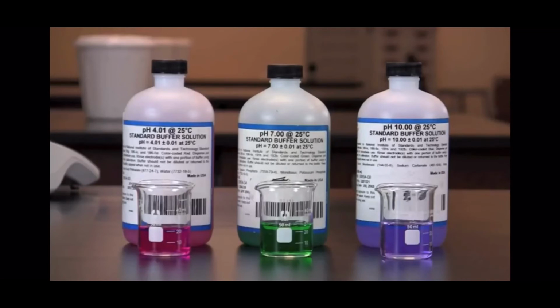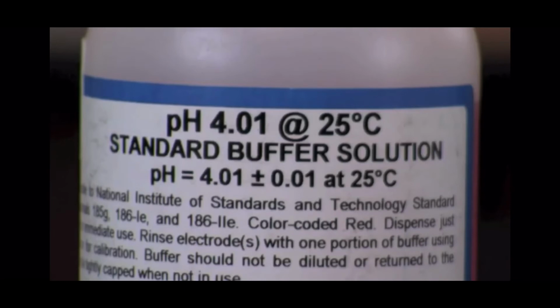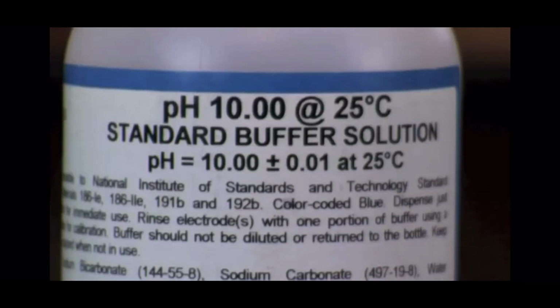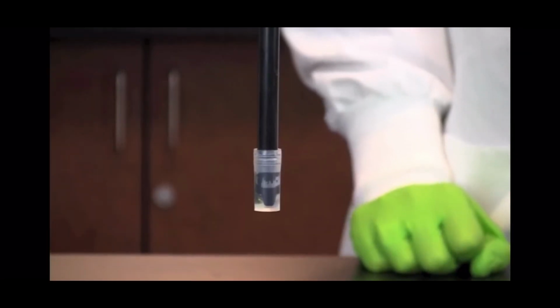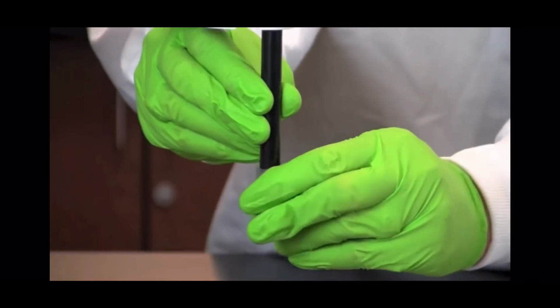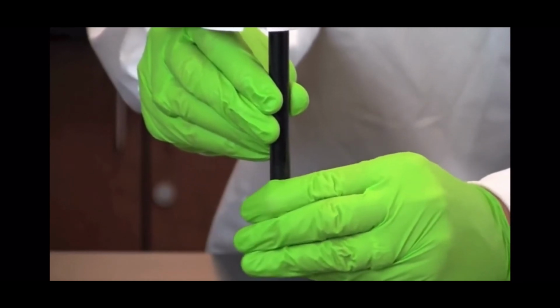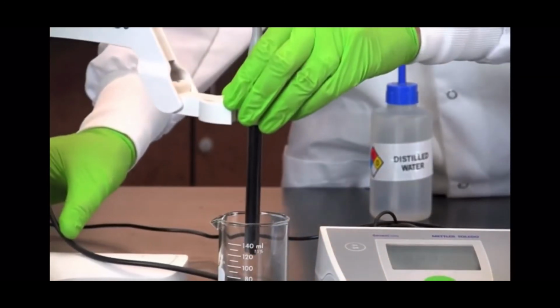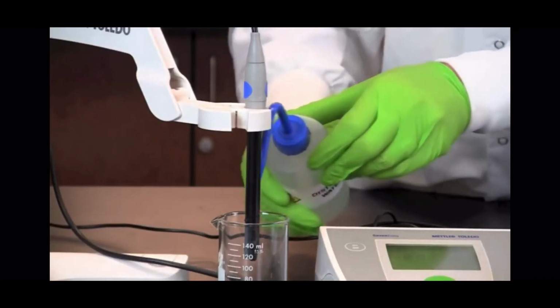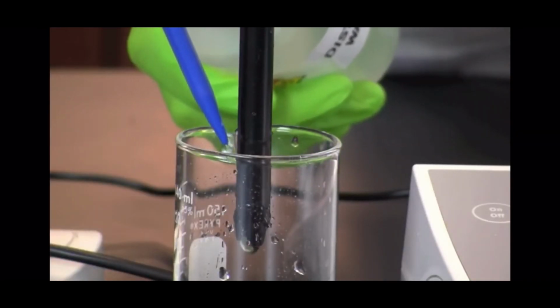Prior to use, a pH meter should be calibrated using color-coded buffers of fixed pH. pH 4, 7, and 10 are standard. The first step in using a pH meter is to remove the protective cap from the electrode. The electrodes of the pH meter need to be stored properly, capped and immersed in a stored solution to prevent them from drying out. Next, the electrode must be rinsed using distilled water.